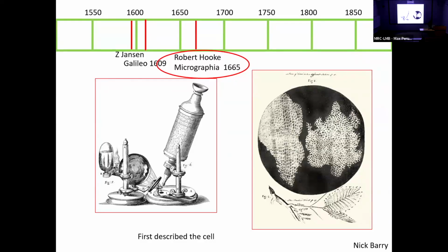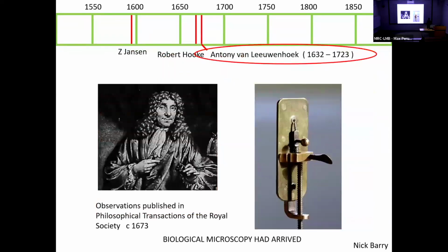This other thing. The other great person in this thing was Van Leeuwenhoek. This is his microscope. His lens is that little drop, that little spherical piece of glass. And his sample was stuck on that pin.